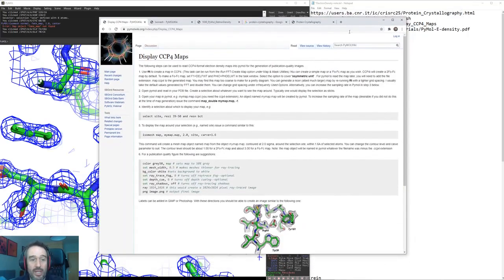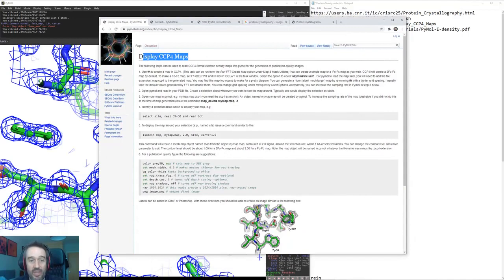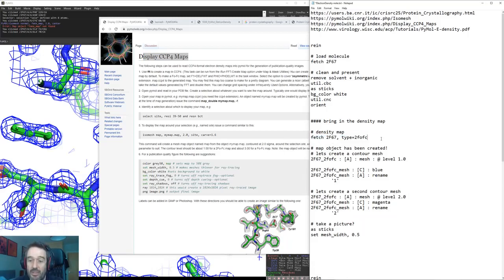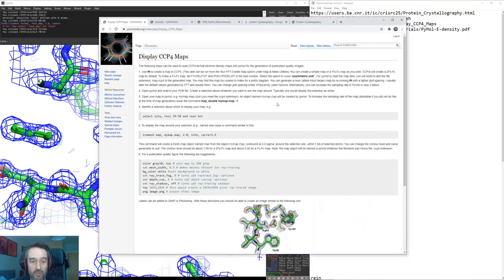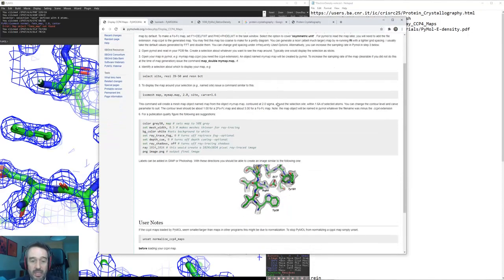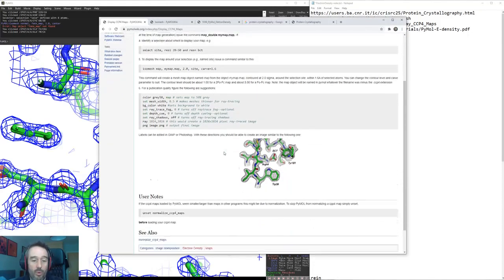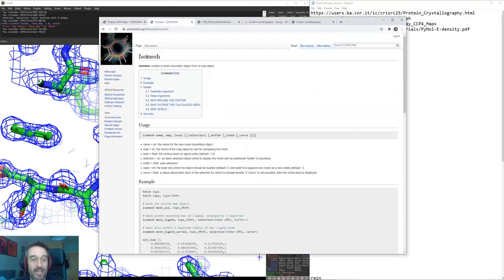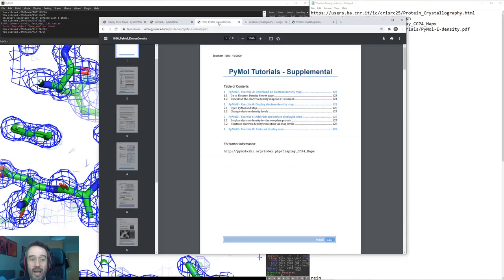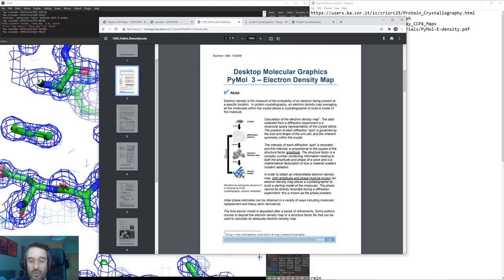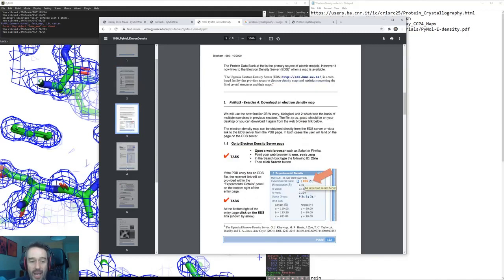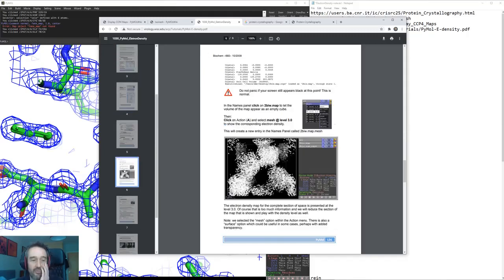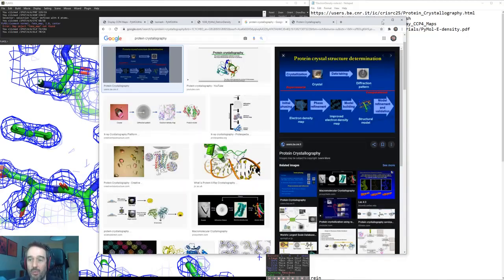If you go into the Pymol wiki you can see that we can display these things called ccp4 maps. We'll be bringing them up using the fetch command with this file type and fetching them in Pymol straight from the PDB. There are resources on the Pymol wiki here that you can look through. Mainly we'll be using the isomesh command. And there are some good tutorials available online which I've given you links for, which go through what is a diffraction pattern, how to view it, where to get the data from and how to see it in Pymol.